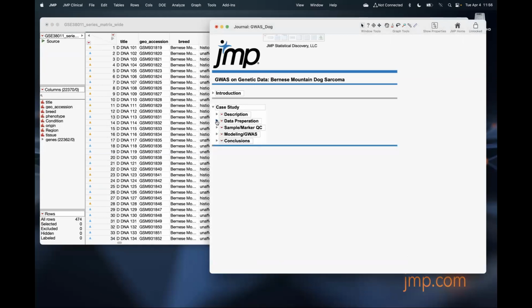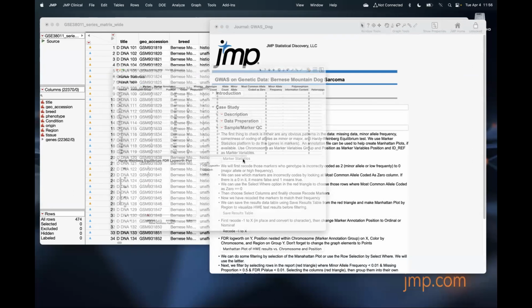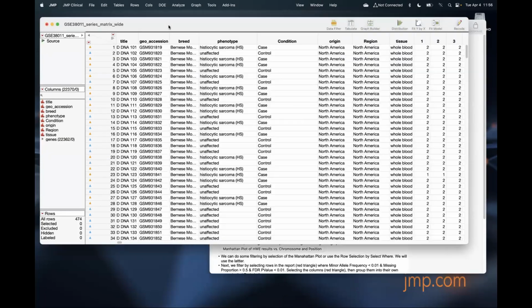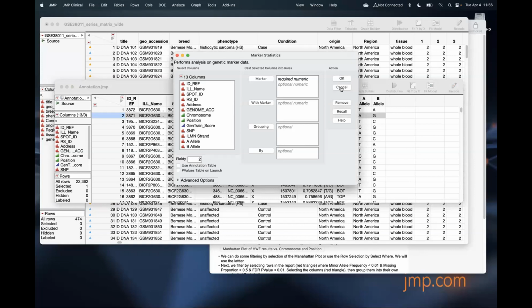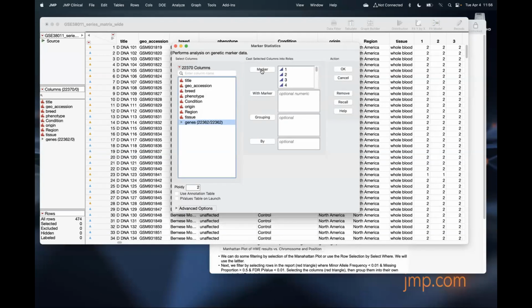So we're ready. The QC part is easy. It's marker statistics. We have it here. Oops, I did something not right. I had my annotation off to the side here. Here we go. So our marker statistics, let's do it manually. I'll show it to you. Here, that's not what I wanted. Here we go. Marker statistics right here. We have all our genes. There are markers, right? We can use an annotation table. We have our ploidy. This is diploid, but you can have multiples.